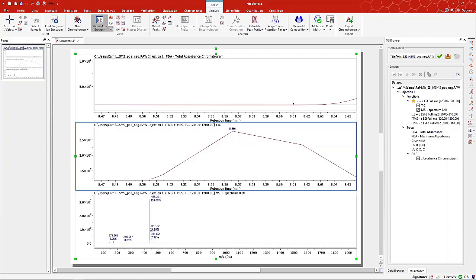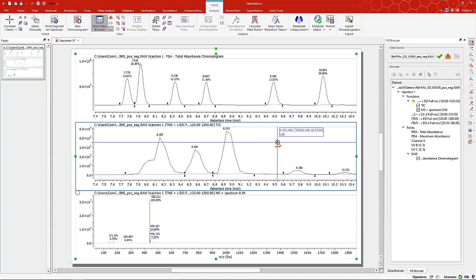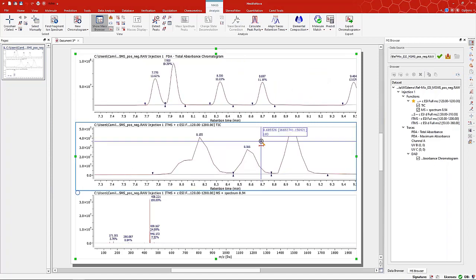How do I get that? Well, if I'm in the pointer mode, I just click the F key. That gets me back to what I call full. So I like to use those three keys rather than dragging my mouse over here, but you could do the same thing here. If you hit escape, you get out of it. So for me, I just love to use the keys on the keyboard. Okay. So let's align the spectrum.